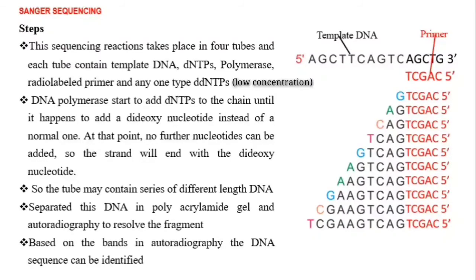That means we'll separate these different fragments of DNA using polyacrylamide gel electrophoresis, and we'll expose this gel for autoradiography, because the primer is labeled with a radioactive label.